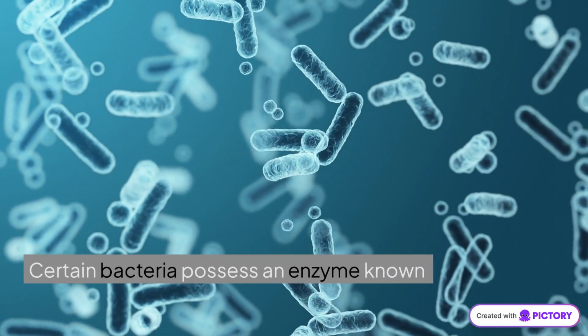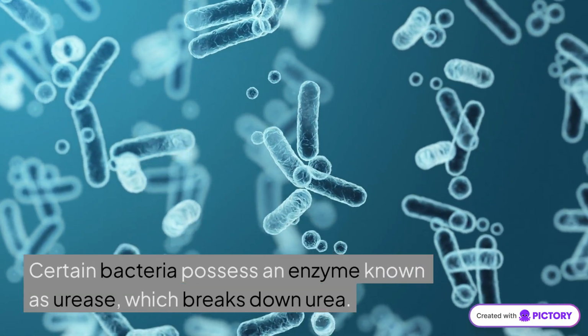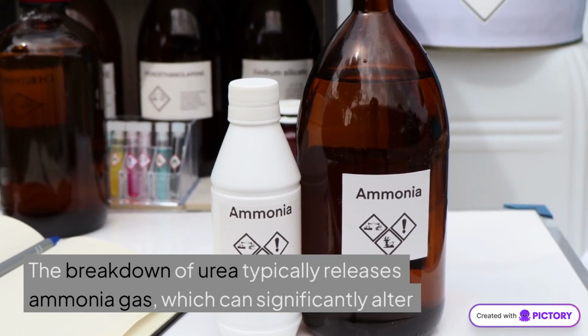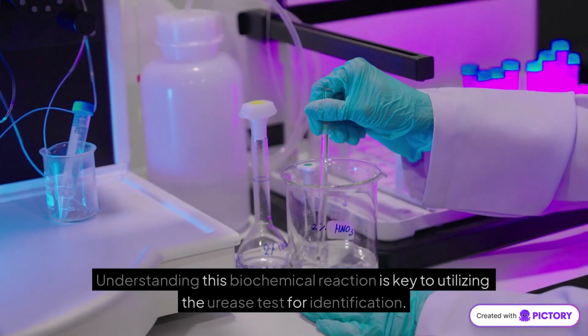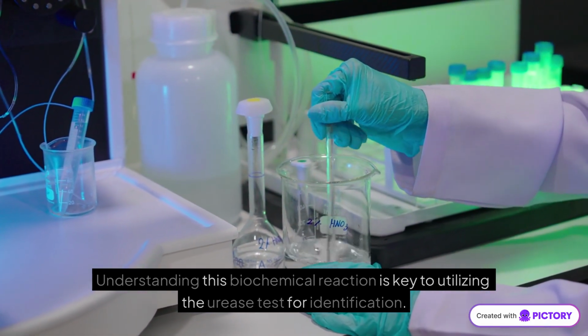Certain bacteria possess an enzyme known as urease, which breaks down urea. The breakdown of urea typically releases ammonia gas, which can significantly alter the acidity of the environment. Understanding this biochemical reaction is key to utilizing the urease test for identification.